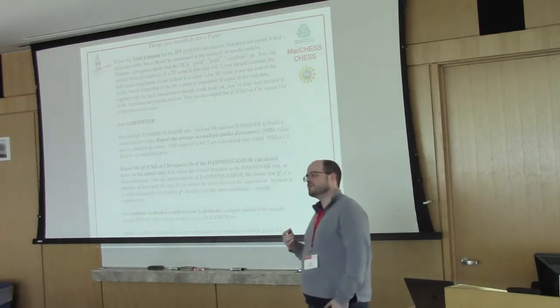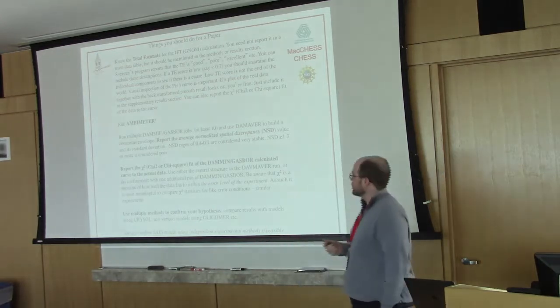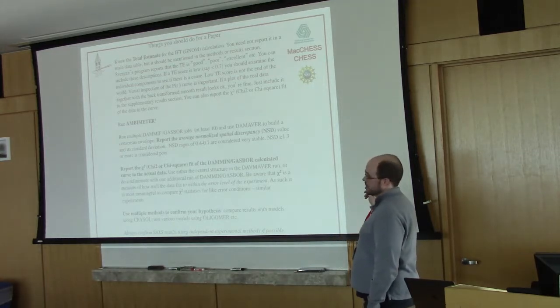So when you do GNOM, it reports back various statistics. You should be reporting those, and you should ideally only be using good statistics. We'll go through what those are in the tutorial tomorrow, so I'm not going to talk about this section too much.